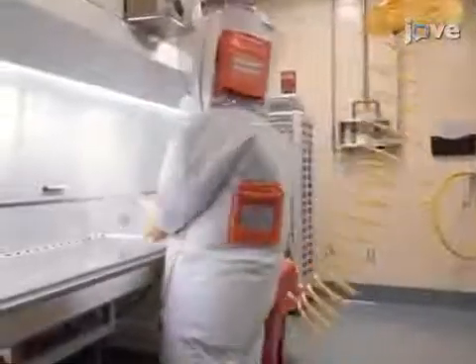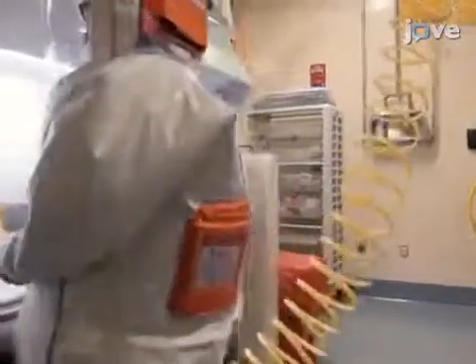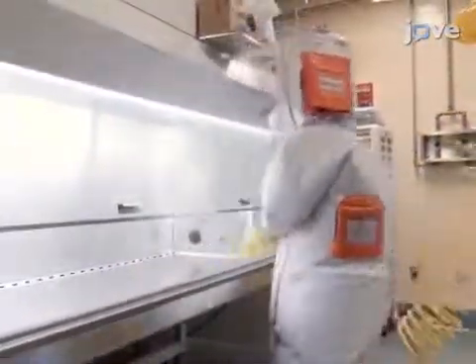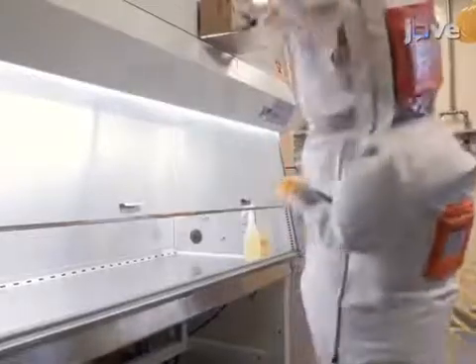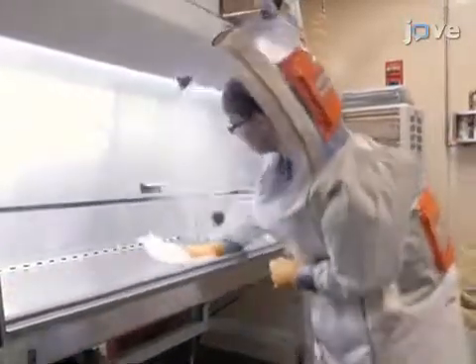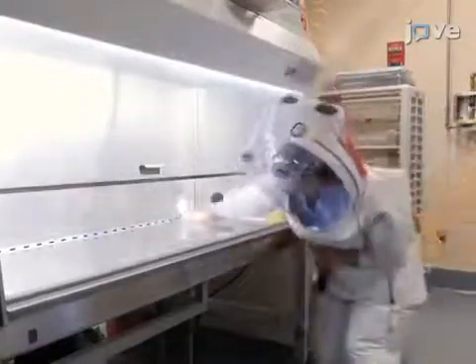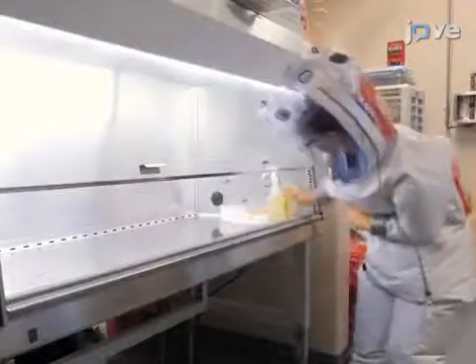Upon completing the daily internal systems checklist, clean the class 2 biosafety cabinet by spraying down the inside, including the sash, with 5% dual quaternary ammonium disinfectant solution. Then wipe down the cabinet with paper towels, being sure to leave the spray bottle containing the disinfectant solution inside of the cabinet to spray gloved hands during and after completion of the assay.